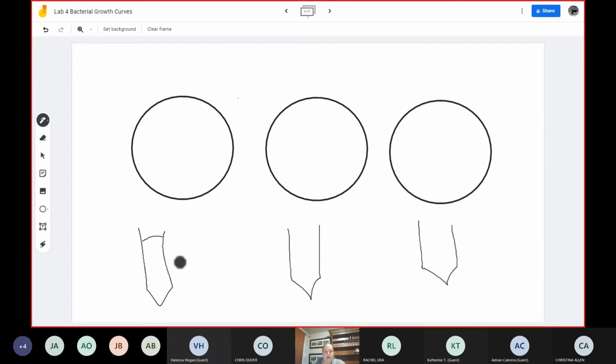So imagine we had that same bacterial colony, 24 hours, E. coli, lots and lots of cells in here. And if we plated that directly onto this plate, instead of 8 colonies, we would probably end up with more than 1 million colonies. Some ridiculously large number that we wouldn't actually be able to count on this plate. Because it is so concentrated and there's so many bacteria, after they double and double and double, they're growing exponentially. So you're going to have a lot of bacteria.